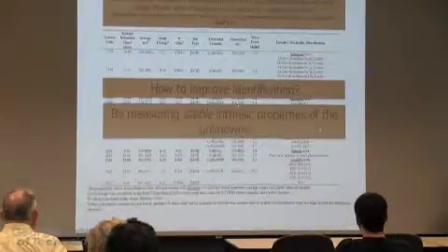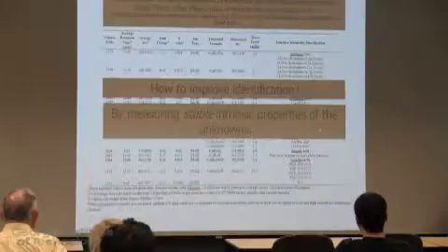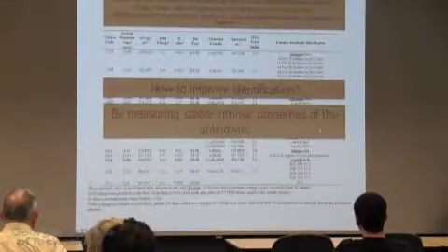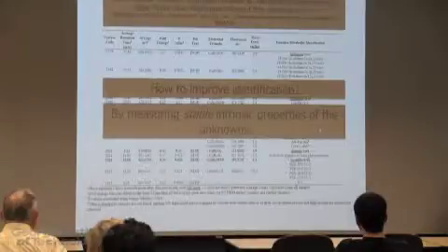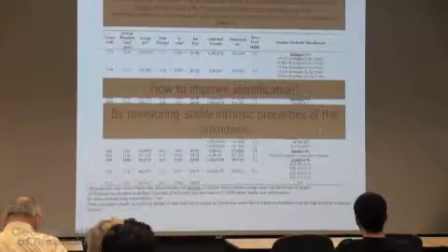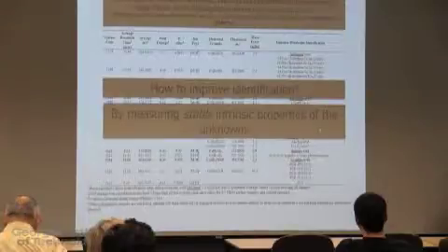And one of the things that we're trying to do is to measure some other property of the molecule. Now, we measured the mass, we measure the fragmentation. Those are intrinsic properties of the molecule. We measure the retention time in a column. That's not really a very stable measure because it changes between different labs, even between different batches of columns. If you've done HPLC, you know what I'm talking about. You put a new column and the retention times change, so it's not very reliable.